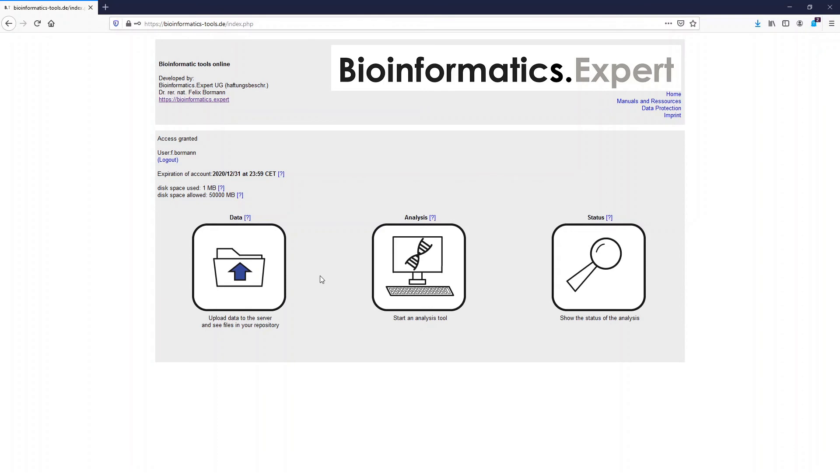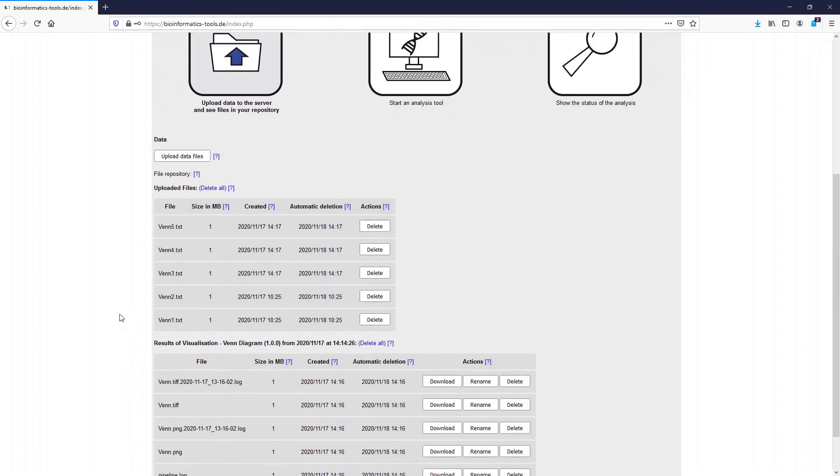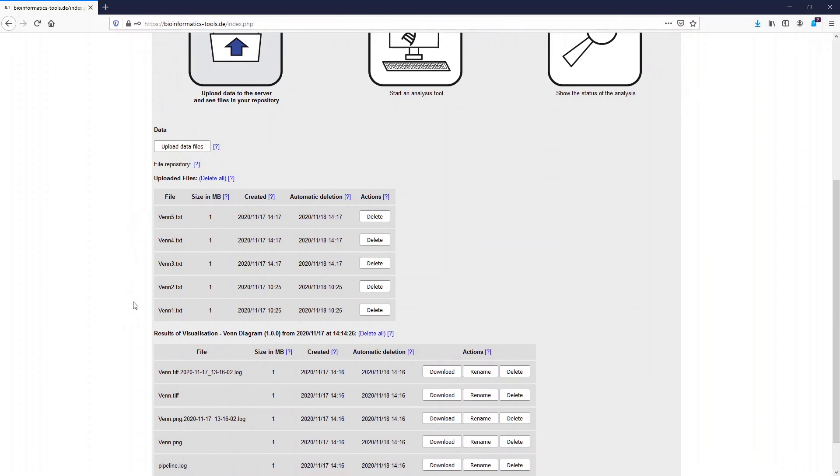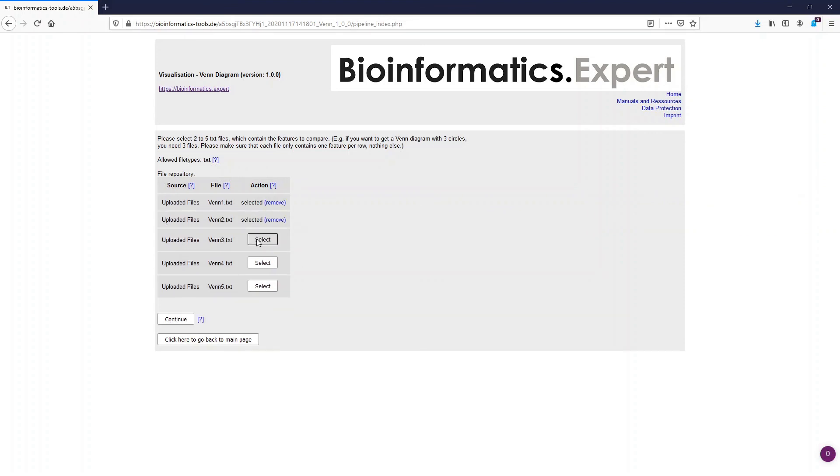If you want to compare more than two groups you just have to upload the additional lists to the program and then select them in the Venn diagram input table.